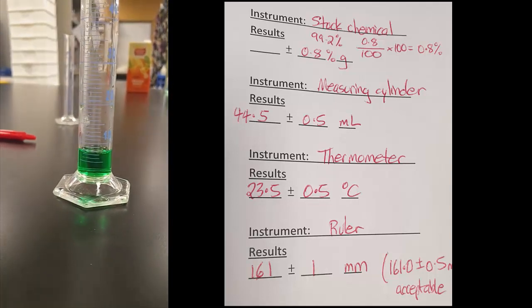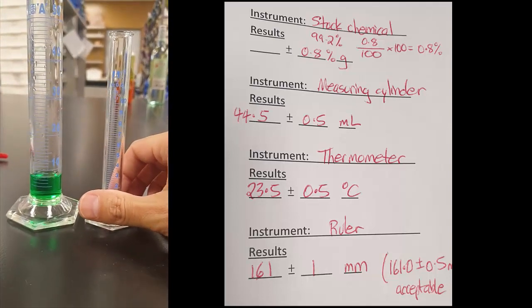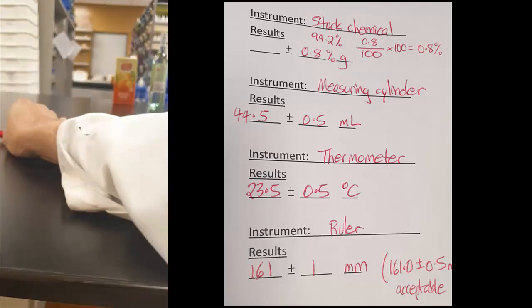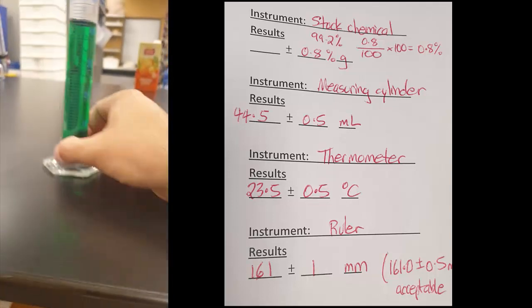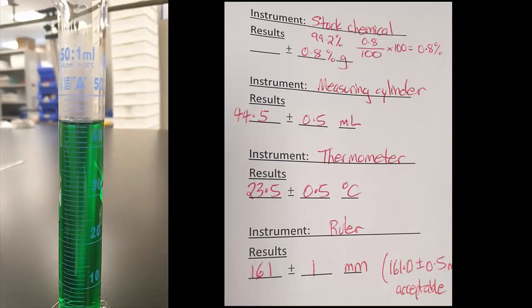Now to the measuring cylinders, you never use a measuring cylinder to measure small volumes. You'd grab instead a 10 mL measuring cylinder and use that instead. So that's inappropriate, and there's also drops on the side. So there's lots of tricks. No one ever gets these all correct, by the way, but now you should.